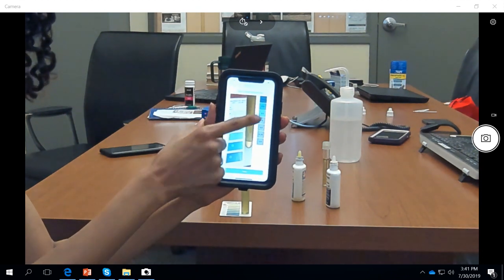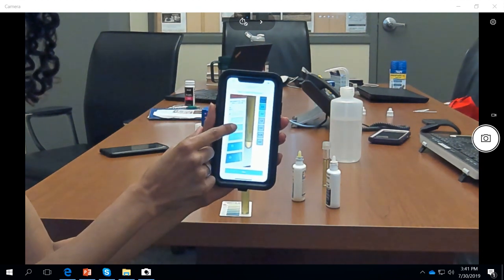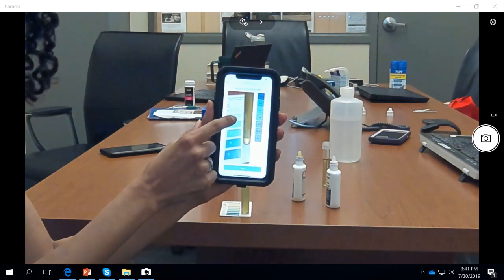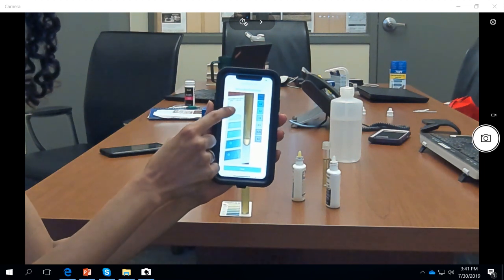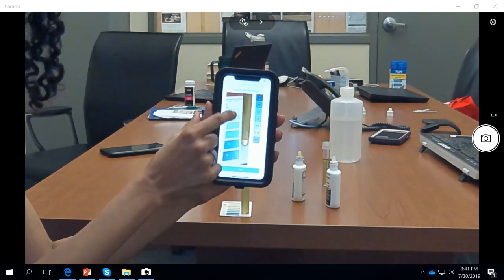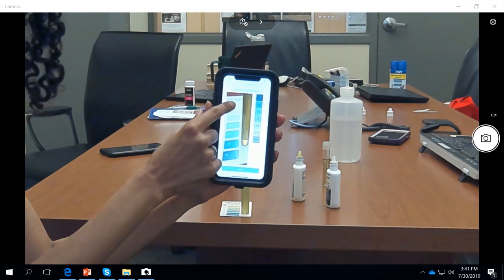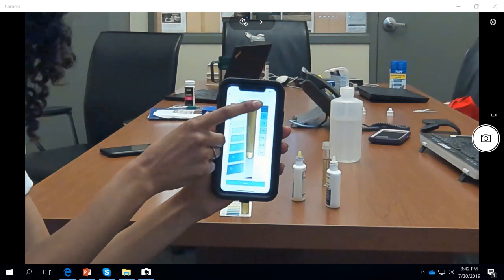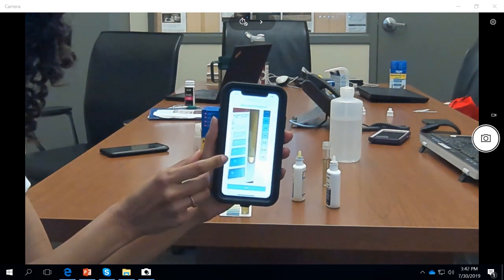2, 2, 1, 1, 0.5, 0.25, and 0. Make sure all the reference colors in the app boxes match the ones in the image.